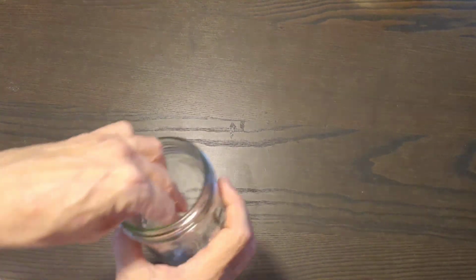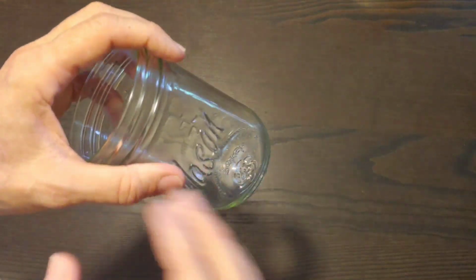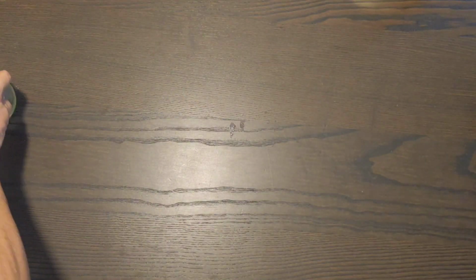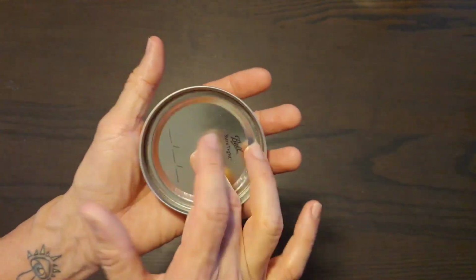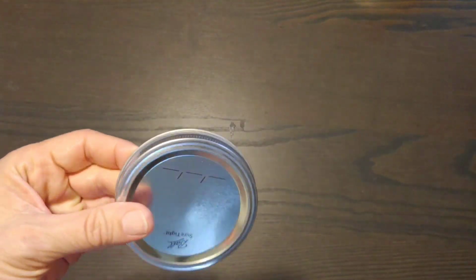Now, a couple more things about these jars. I'm not using these anymore. I kept forgetting to put them in, and I haven't seen that it makes that much of a difference. It's supposed to break up the mycelium when I shake it, but it breaks up fine without it, so I haven't been using it. Now, these I don't like at all. Most people flip the lid to put them in the pressure cooker. I think it's an extra step. They get rusty. I don't like these. I don't know how well they seal either.